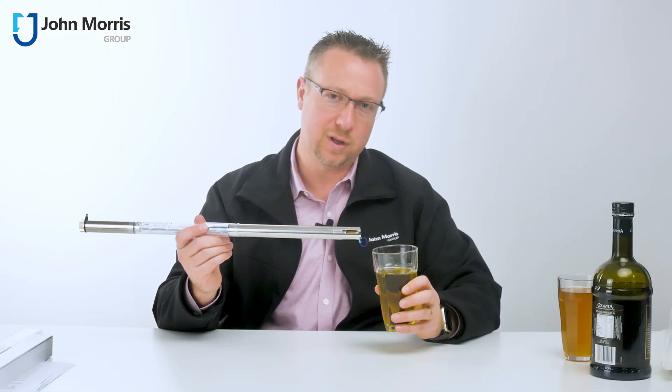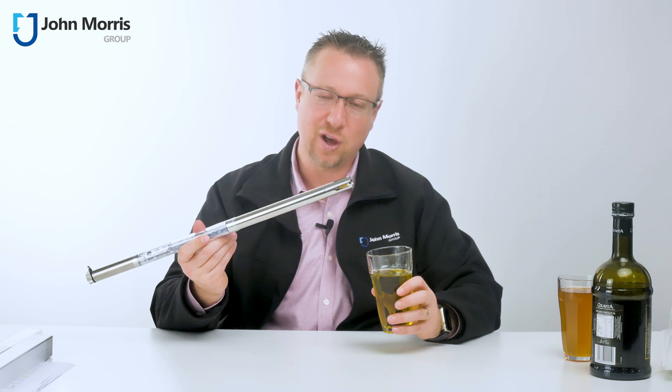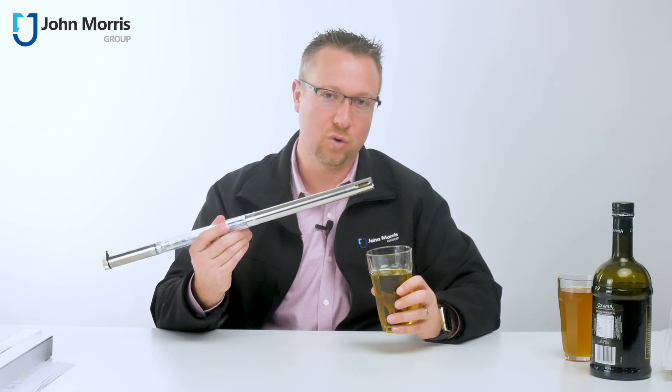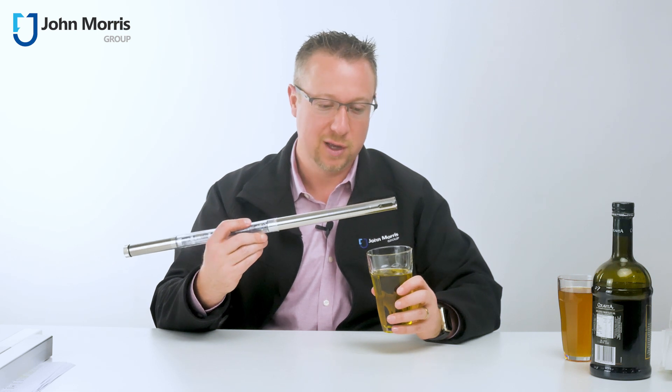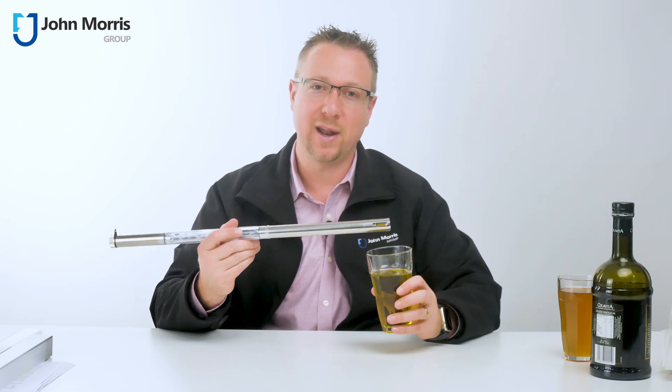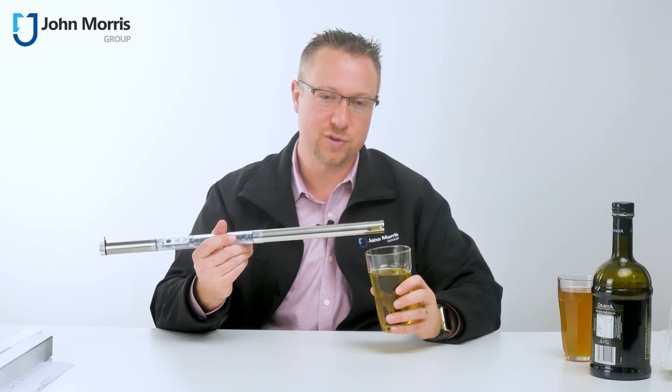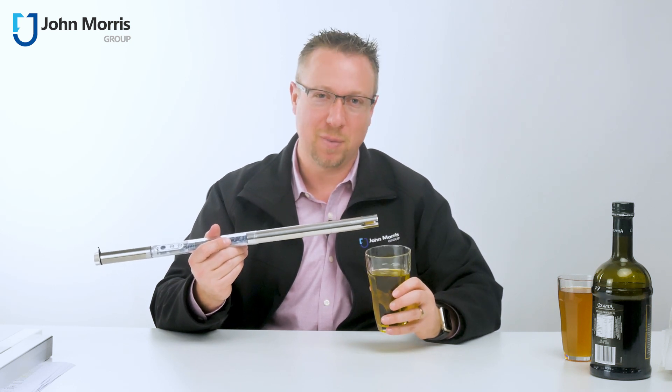So that's the Dom24 from Otago, and I'm really excited about this product. It's the neatest thing for making sure that your cooking oil is still safe to use. I'm personally looking forward to having no more headaches and no more sick feelings after eating deep fried foods. Thanks so much for watching, and bye for now.